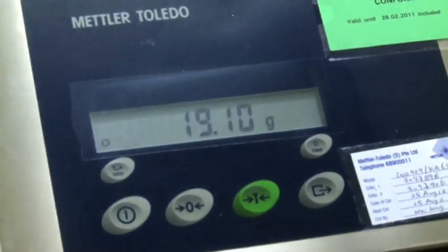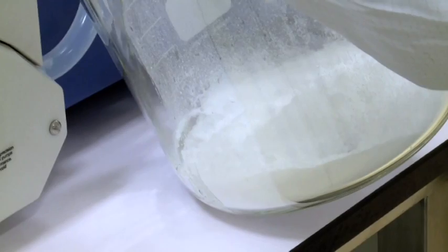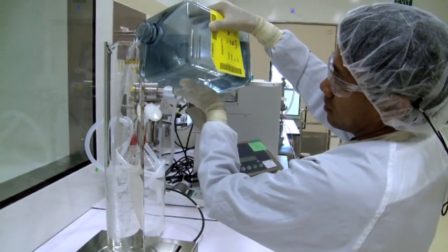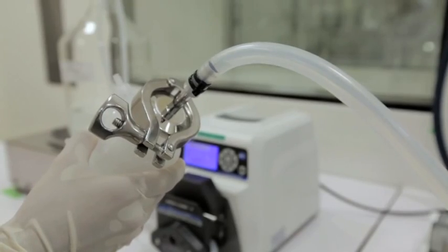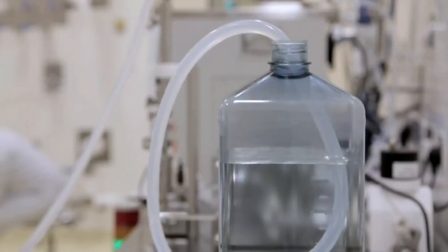The polysaccharides are weighed under a controlled atmosphere to control moisture content. Once this is done, the powder is dissolved in an appropriate buffer. Before proceeding to the next process, the dissolved polysaccharides are first broken down to reduce their size by means of high pressure.